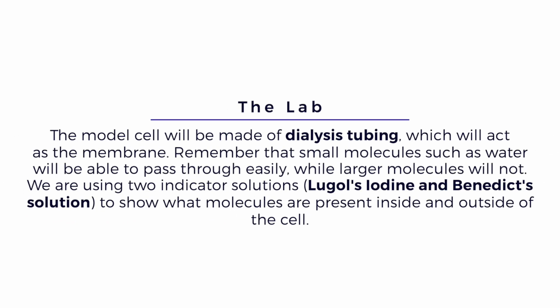The model cell will be made of dialysis tubing, which will act as the membrane. Remember that small molecules such as water will be able to pass through easily, while larger molecules will not. We are using two indicator solutions, Lugol's iodine and the Benedict solution, to show what molecules are present inside and outside of the cell.